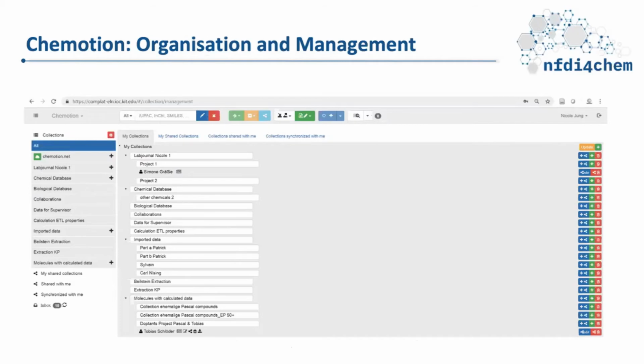But this Chemotion instance is a web-based tool which can be installed locally at the universities, or the public instance can be used. And the primary goal was to capture the information right from the beginning, where you plan your experiment or the reaction directly on Chemotion. And then you perform the experiment and capture the information all along the way. And then you add the metadata as and when you get the data from the experimentation. And ultimately all the spectra or the analysis can be directly captured on Chemotion. Finally, the data can be pushed to federated repositories as and when they appear.